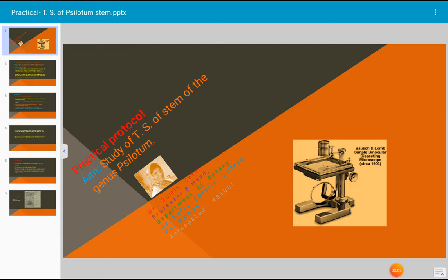Today's topic for discussion is a practical protocol of pteridophytes. The aim of today's practical is study of transverse section of stem of the genus Psilotum. Psilotum is a pteridophytic plant.